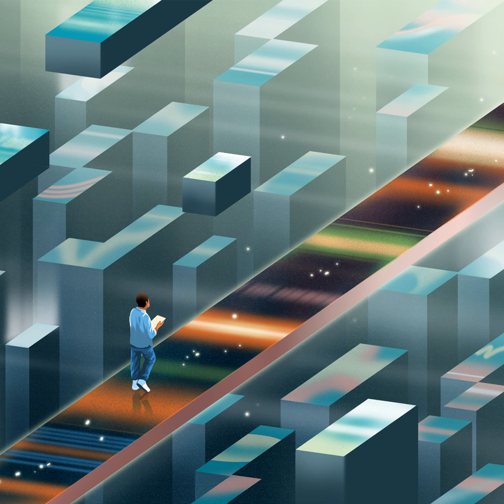Genomics is in the midst of a major transformation thanks to the advent of technology that can read sequences up to tens of thousands of base pairs long. Known as long-read sequencing, this method brings with it a host of new capabilities. Unlike the current standard, short-read sequencing, it can easily generate whole genome sequences from scratch without the need for a reference genome. It can sequence RNA directly and detect chemical modifications involved in gene expression.